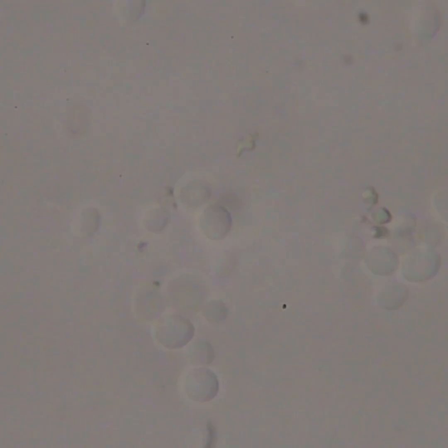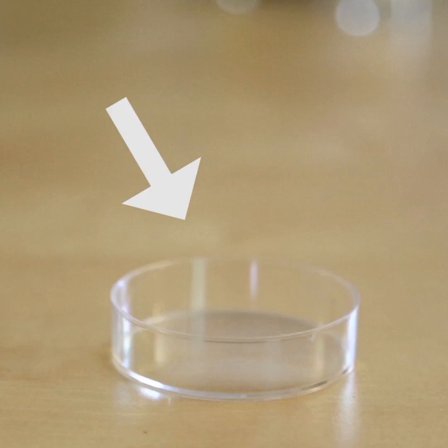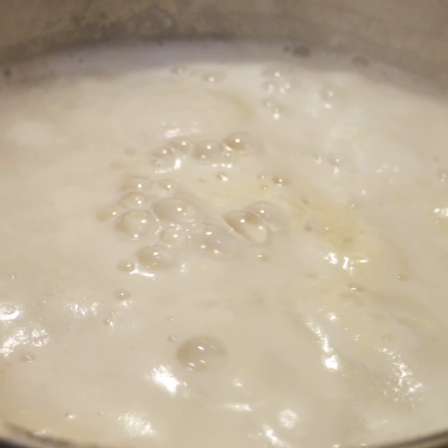In order to isolate a specific strain of yeast or bacteria that we can use for homebrewing, we're going to have to do some science. In order to continue, you'll need a few unusual ingredients. You'll need petri dishes in which to conduct your experiments, and you'll need agar powder, which is a gelatin-like substance that's added into things for cooking to make them gooey and gelatinous.